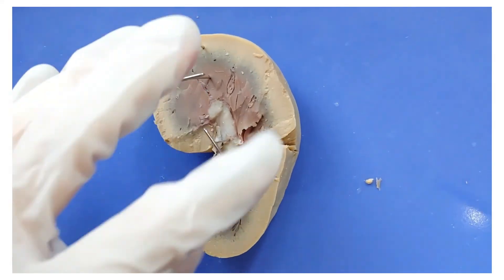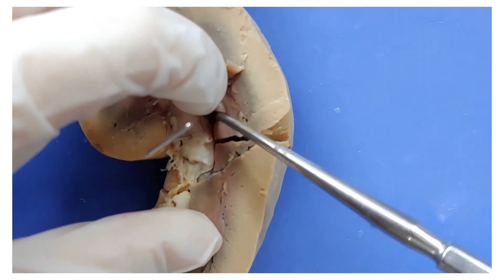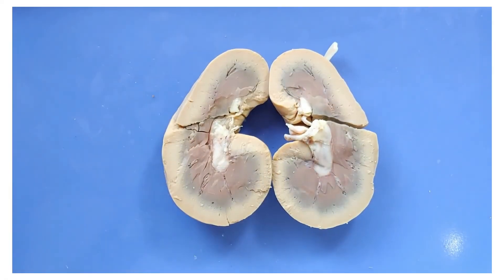I'm going to turn it around so you can see a bit better. I'm going to follow one of the side branches of the pelvis as far into the cortex as possible using a metal probe. You can see a side branch of the pelvis here.